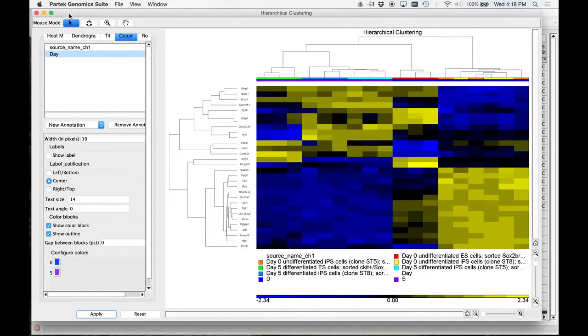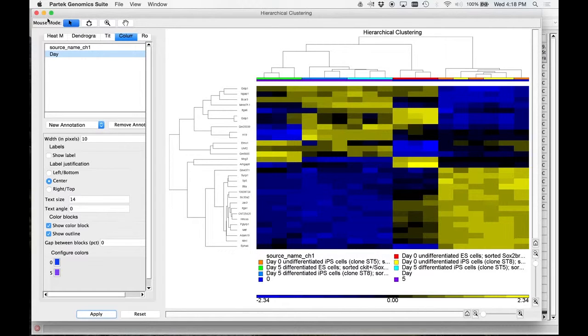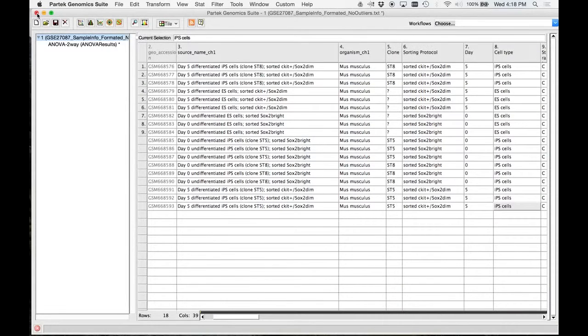So let's get out of here. That's how you make a heat map. Hierarchical clustering heat map.